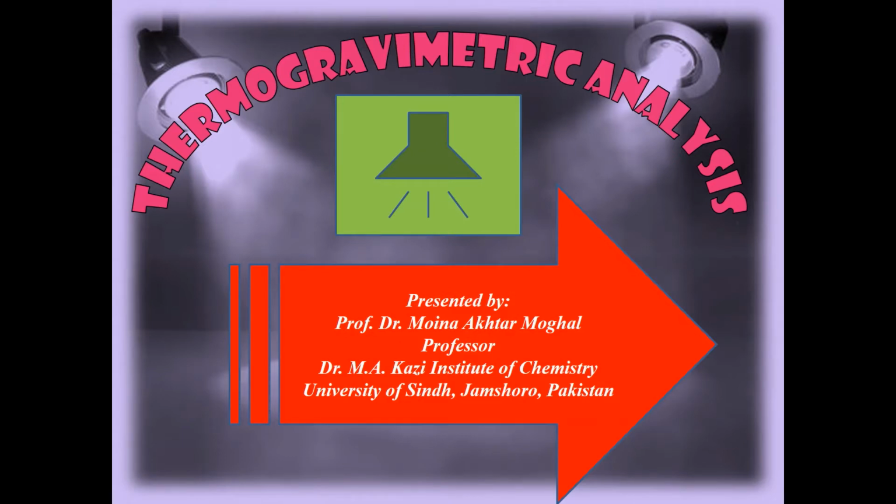Thermogravimetric analysis or thermoanalytical studies. Thermogravimetry is a valuable technique to record changes in mass as a function of changes in temperature. It's a way to find changes in weight related to the change in temperature. It can be abbreviated as TGA and is used in characterizing different compounds and their degradation temperatures, etc.